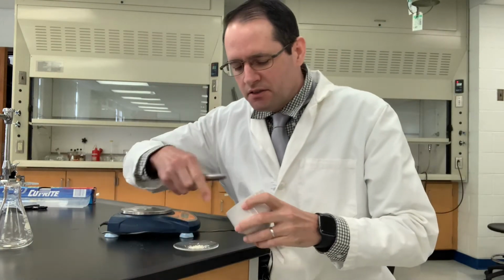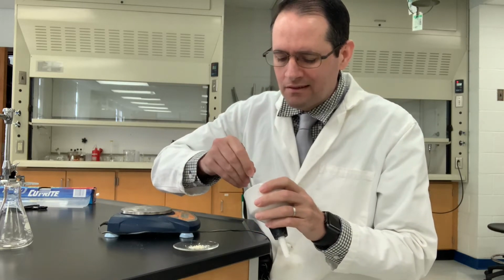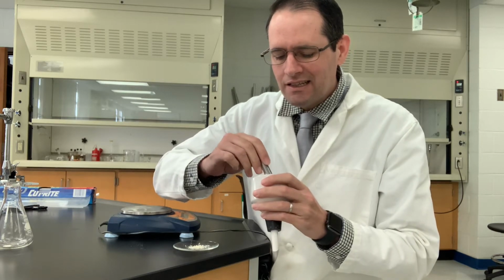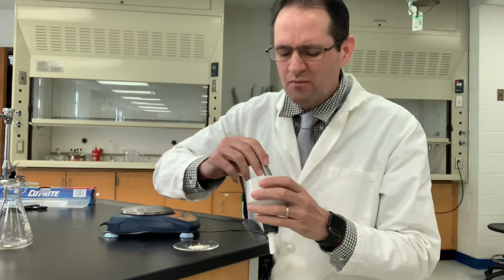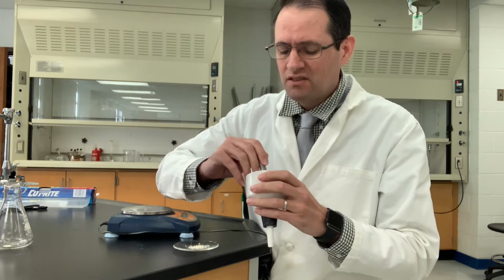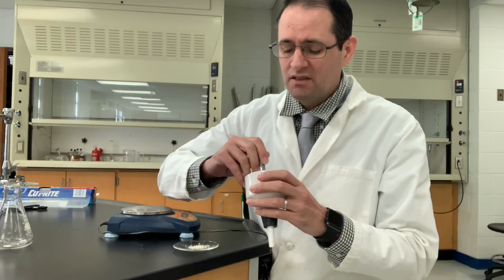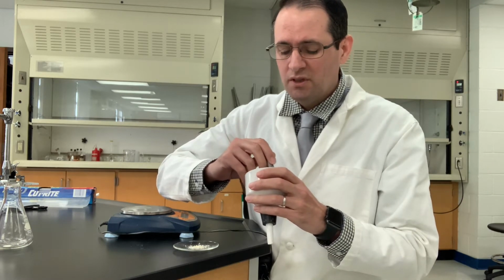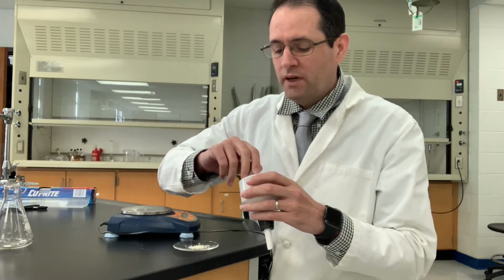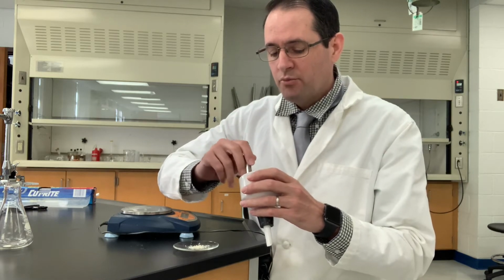To do this at an angle that you might be able to see this. Actually, the powder seems a little bit moist, but I'm not using this balance for anything else for the next couple days, so I'm just gonna put this on the tabletop here, and I'll weigh it periodically and we'll see what the mass is. Of course, when it reaches constant weight, that's when it should be the lowest mass and all of the water should be evaporated.